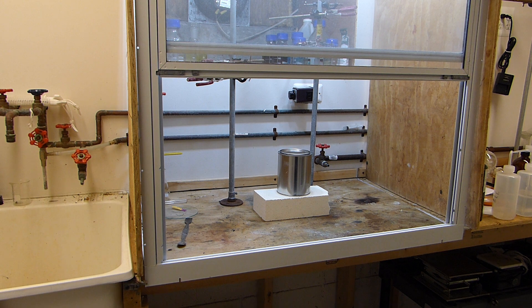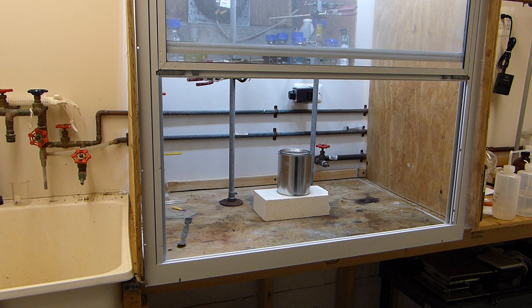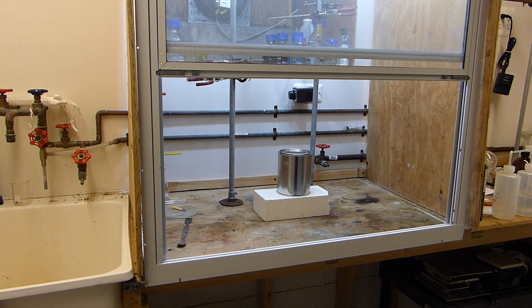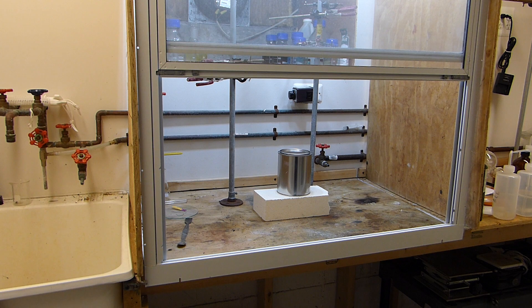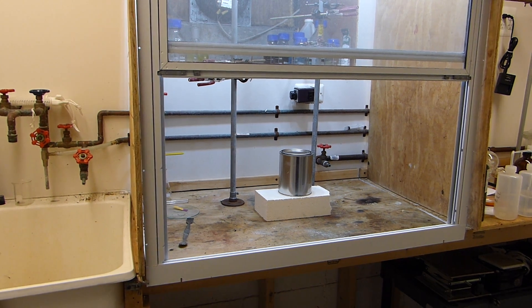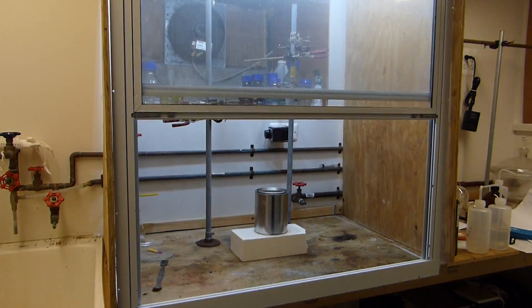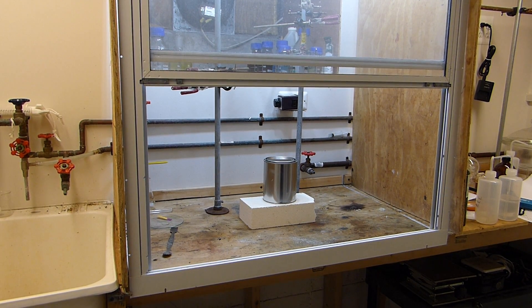Okay, so I lied a little bit in the last clip. I'm actually going to do it inside. I was going to do it outside but I stepped out and it was pouring rain and it's pitch black out there obviously because this time of winter in the northern hemisphere. Did not expect it to be raining because it's the middle of January in Michigan. Anyway, since the weather is poor, I've decided to set up my fume hood. Now you probably haven't seen this fume hood unless you've watched the very beginning video of this entire channel and this fume hood is pretty interesting.